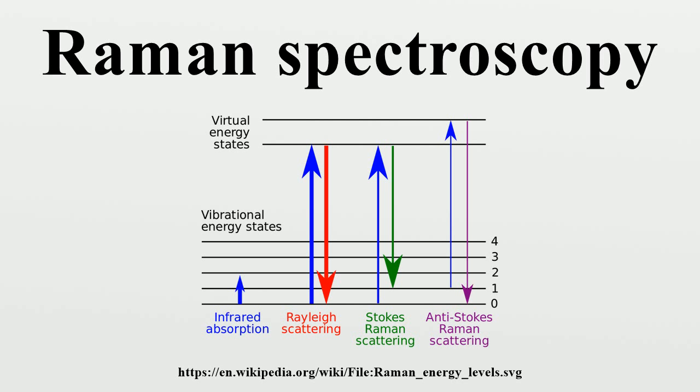forensic trace evidence. A Raman microscope begins with a standard optical microscope, and adds an excitation laser, a monochromator, and a sensitive detector, or photomultiplier tube. FT Raman has also been used with microscopes. Ultraviolet microscopes and UV-enhanced optics must be used when a UV laser source is used for Raman microspectroscopy.